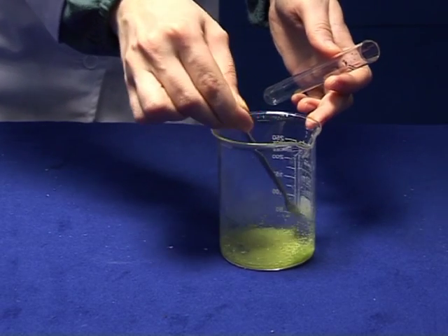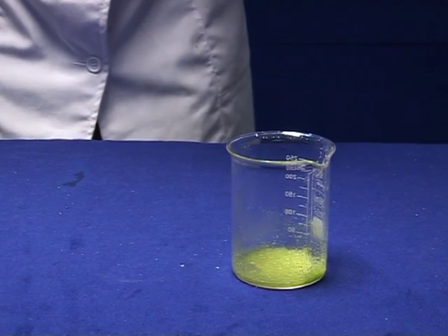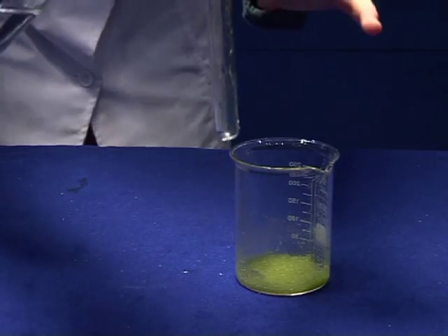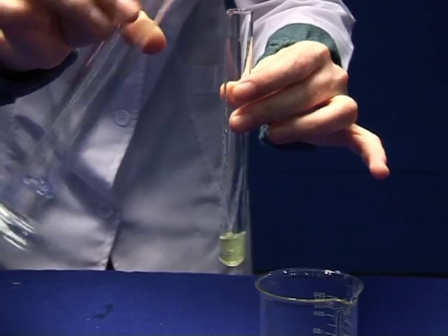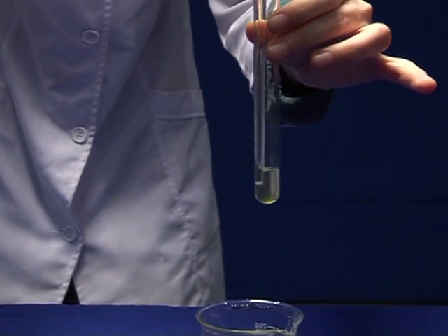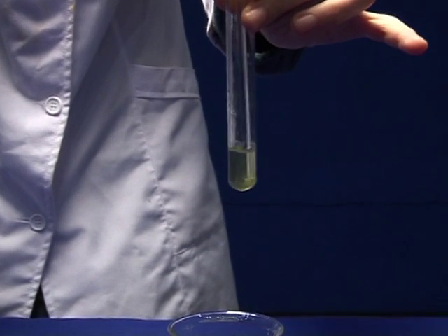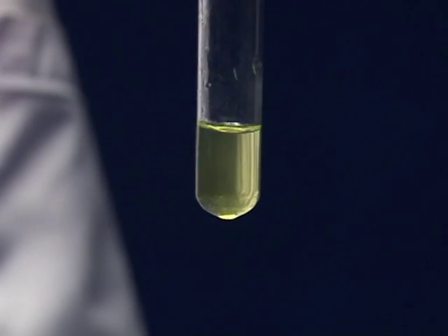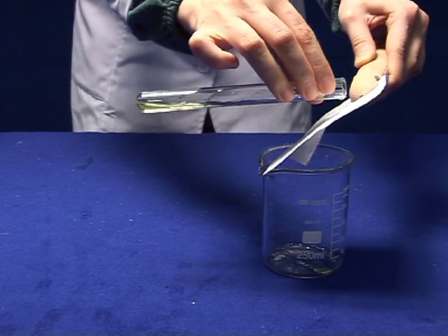Blue printing. Transfer a pinch of potassium trioxalatoferrate trihydrate into a test tube and dissolve it in a minimum amount of water. Wet a piece of filter paper with the iron oxalate solution prepared in the previous stage.